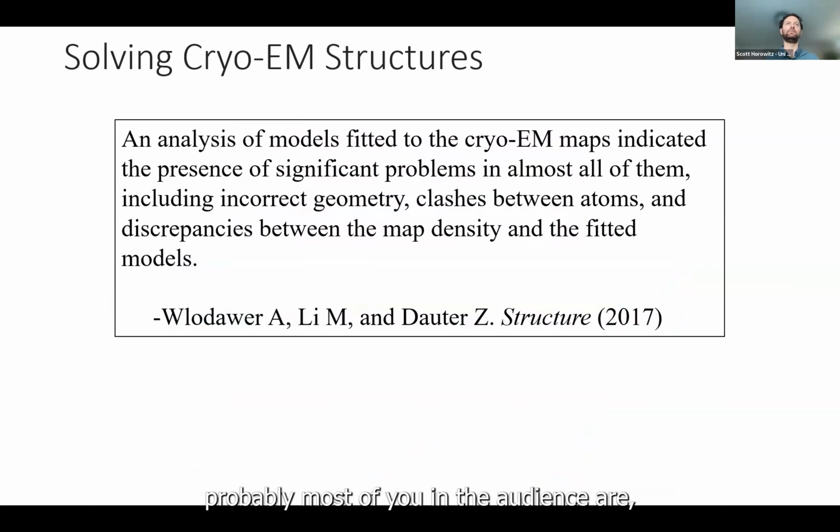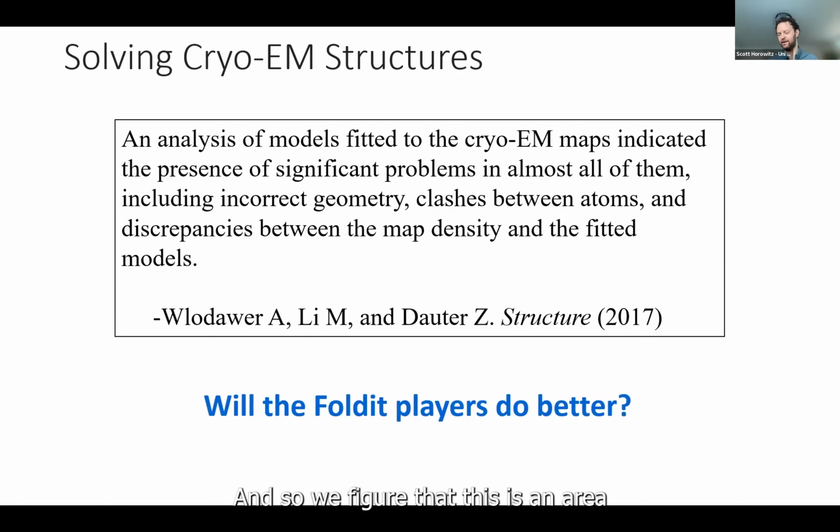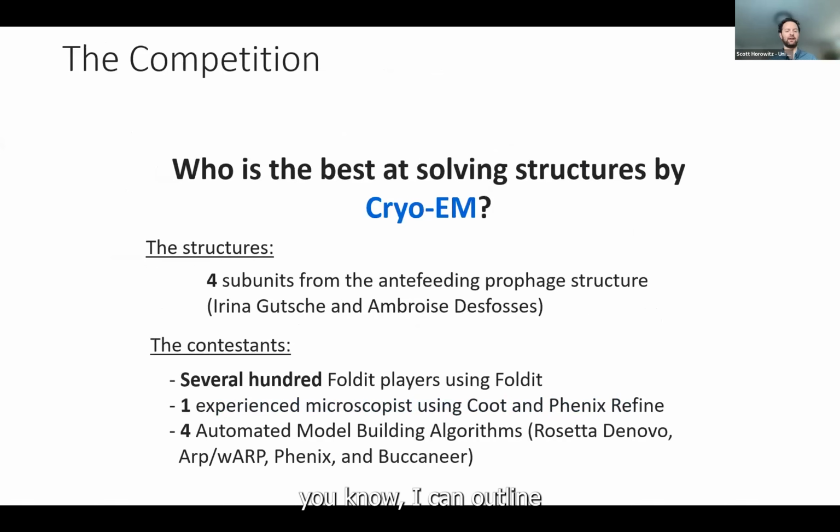And of course, probably most of you in the audience are well familiar with that there are many not great cryo-EM structures out there. Probably on a percentage basis, it's a bigger problem than crystal structures. And there's a variety of reasons why that's the case. And so we figured that this was an area of particular need. And so we asked whether the Foldit players could do better. So if you go to the next slide, I can outline who was doing this particular competition.